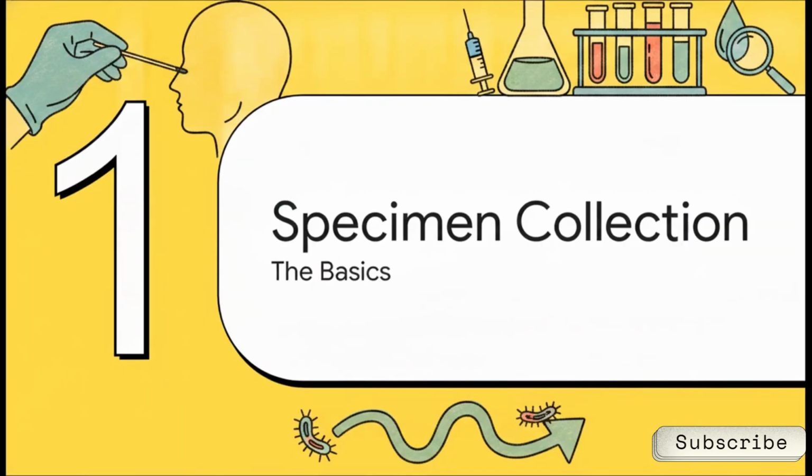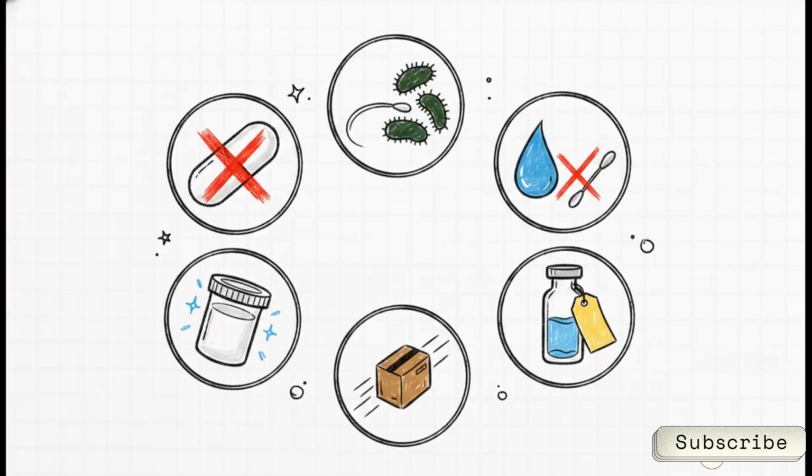All right, part 1, specimen collection basics. Getting the right sample is literally the most critical step of lab diagnosis. If the sample is bad, your downstream results are useless. So to effortlessly nail the general principles of collection for your short answer questions, just memorize the acronym CABLES.